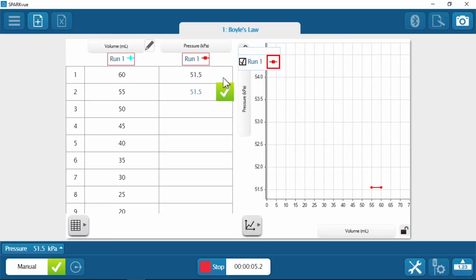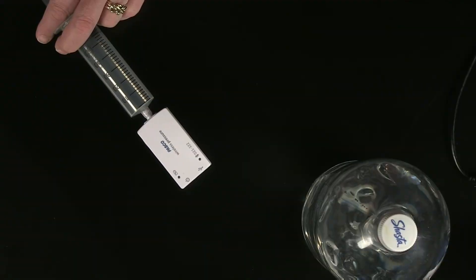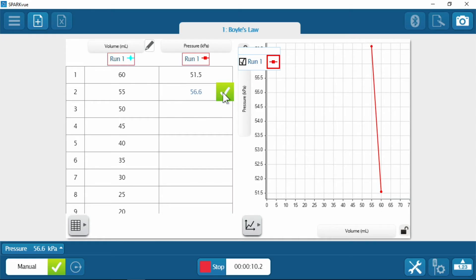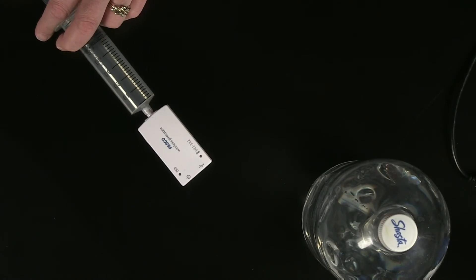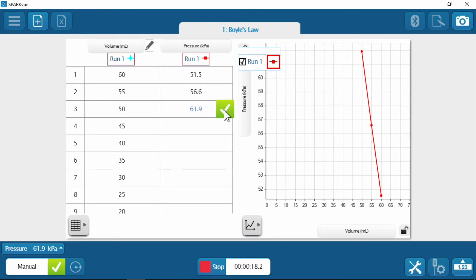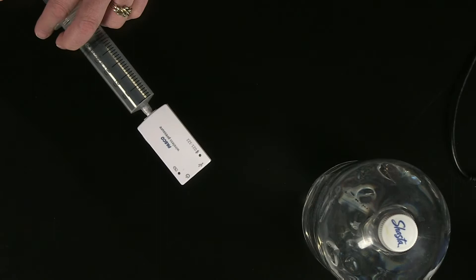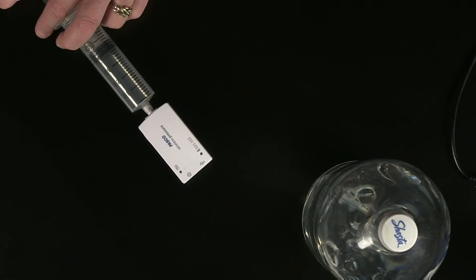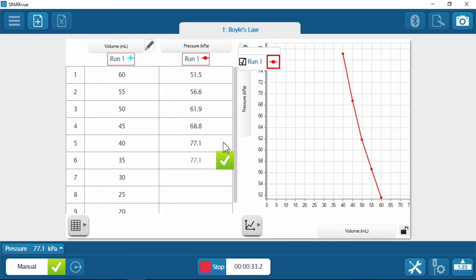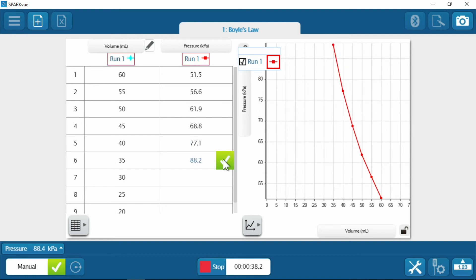Now move that plunger to 55. Good. And 50. We're going to let it sit for a second, because I know I can change the temperature as well when I push or pull on this thing. That is a very good observation. 45. There we are. Let's give 40 a go. There I am. And 35. How about 30?